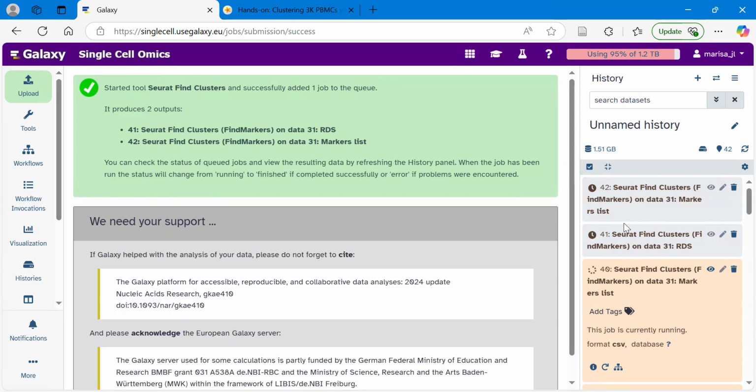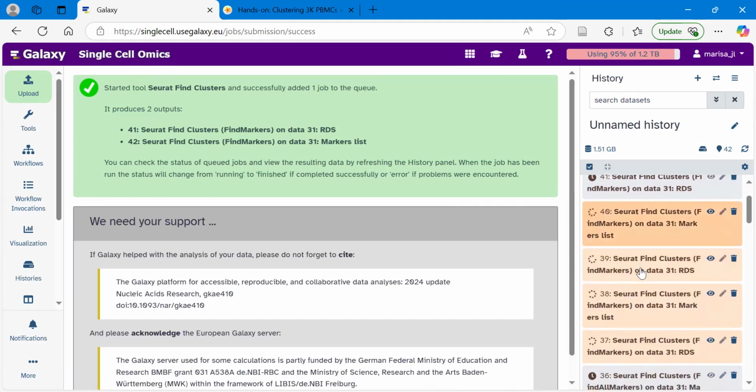So this is going to give us a score for the genes between 0 and 1, where 0 means that gene doesn't help us identify the cells that should be in that cluster, and 1 means that gene is only really expressed by cells within that cluster and not by any of the other cells in our data set.